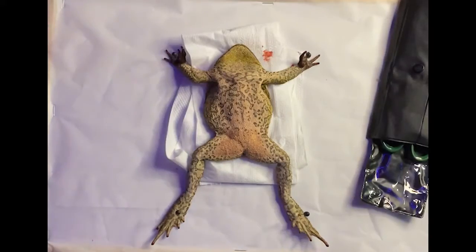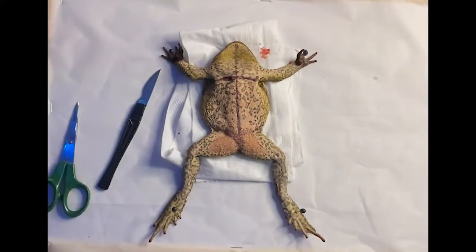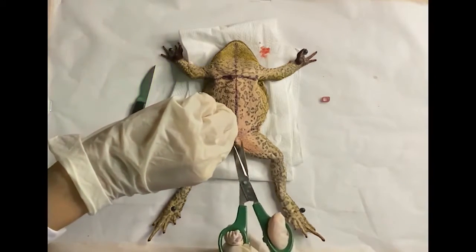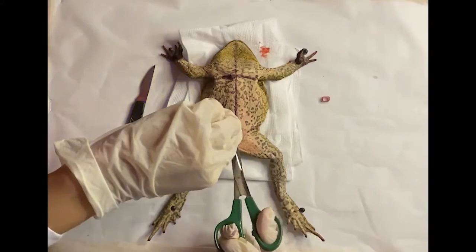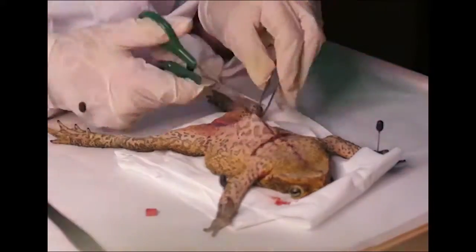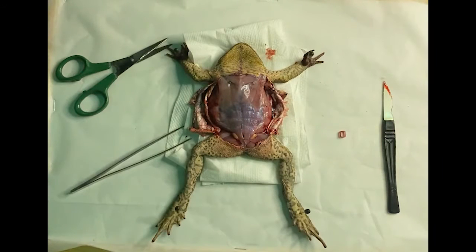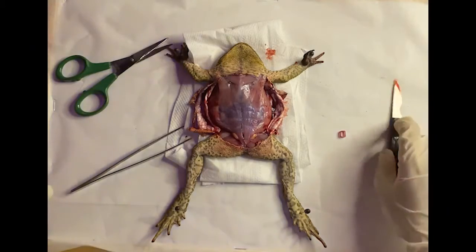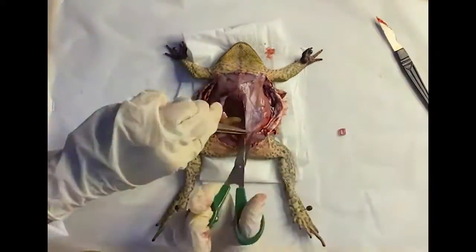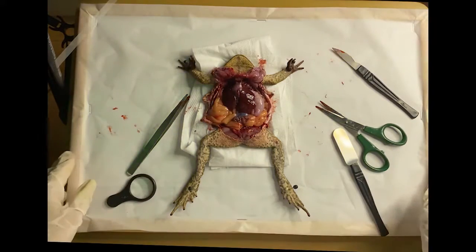But before dissecting him, I will be drawing incision guides on his skin. Now, using the forceps, I am lifting his skin on the bottom part of his body to make it easier to cut through. After cutting through his skin, we can now see his muscles underneath, and I will also be cutting through that. And finally, the frog's internal organs are exposed and ready to be examined.